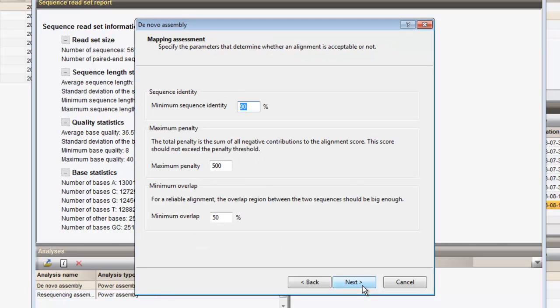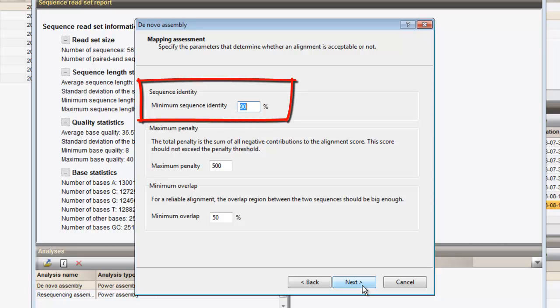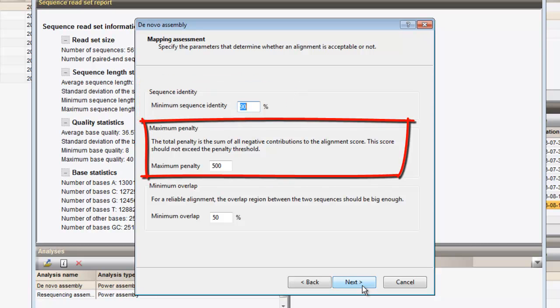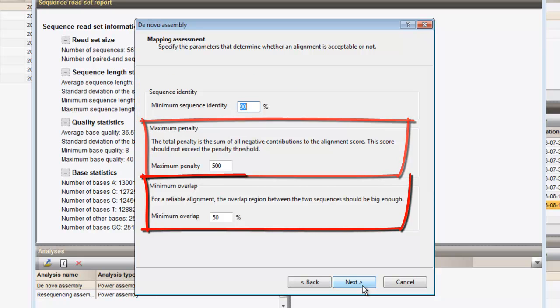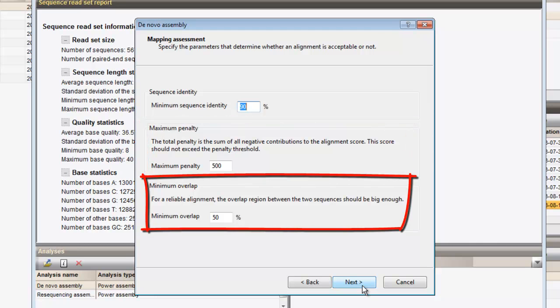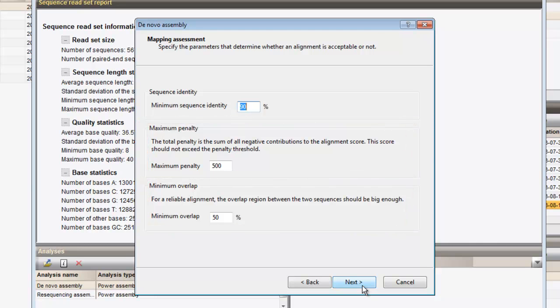After aligning the reads, the mapping is assessed. Parameters used for this assessment are the sequence identity, the maximum penalty score, and the minimum overlap region for the alignment. Again, for this analysis, we can leave all settings at their default values and proceed.